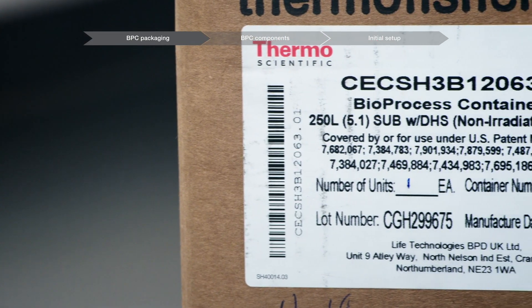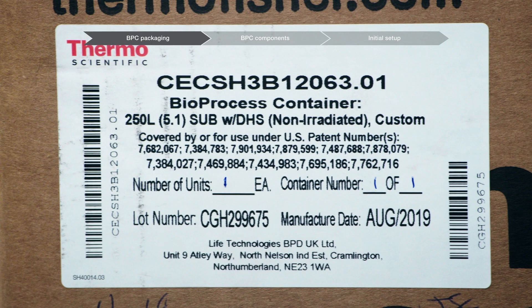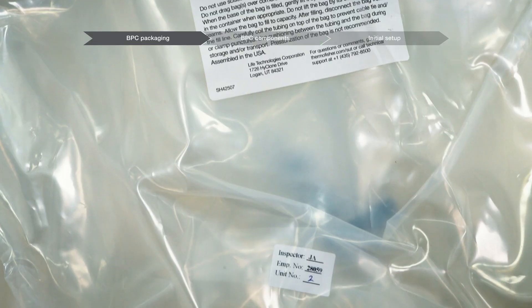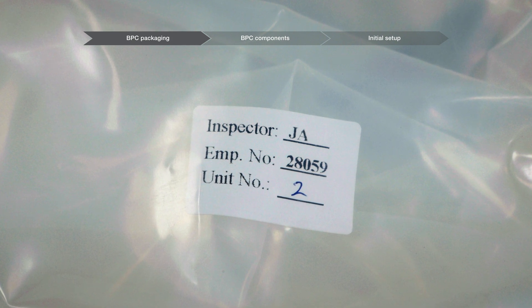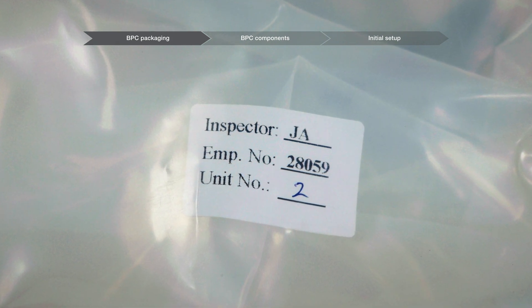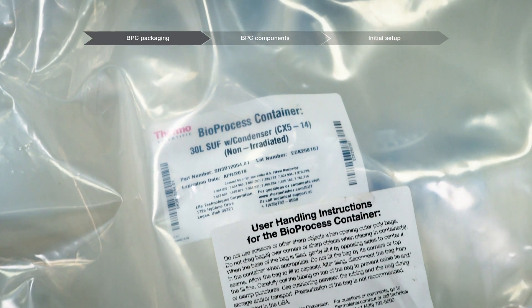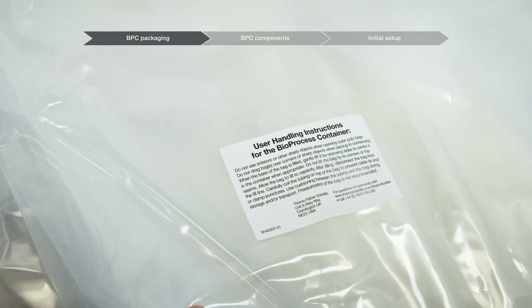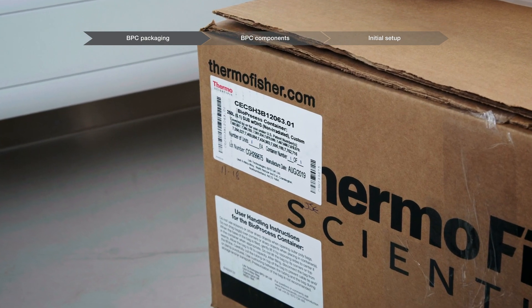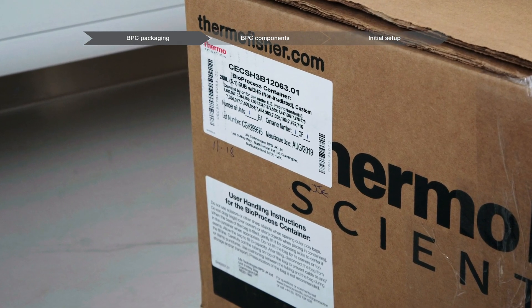The product label includes the lot number, the description, the manufacturing date for custom products, and the expiration date for standard products. The innermost section of the first poly bag surrounding the product contains the inspection record label, which includes the inspector's initials, the employee reference number, and the unit number. It may include the product label and component labels for filters with a serial number. The outermost poly bag may include the user handling instructions for the BPC label. The box labels include the product label, user handling instructions for the BPC, filter labels, and box inspection label.